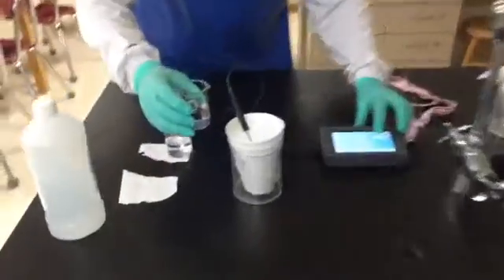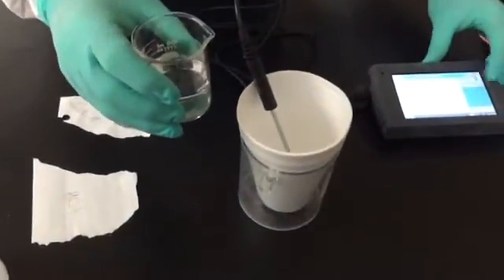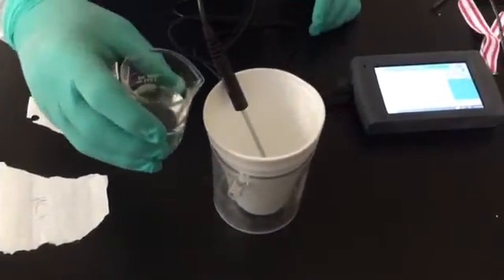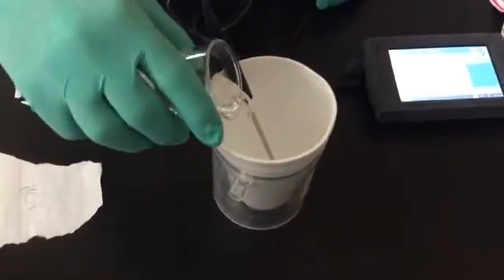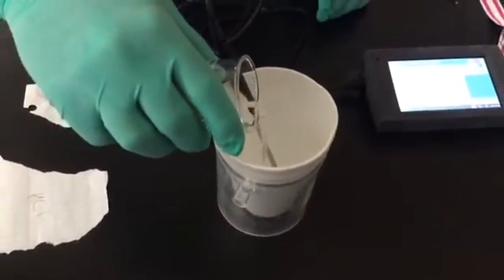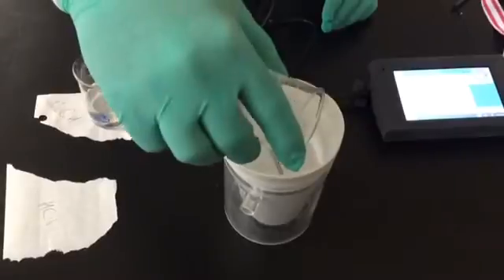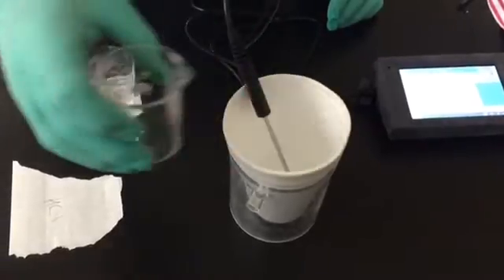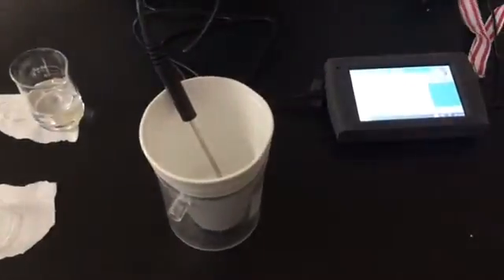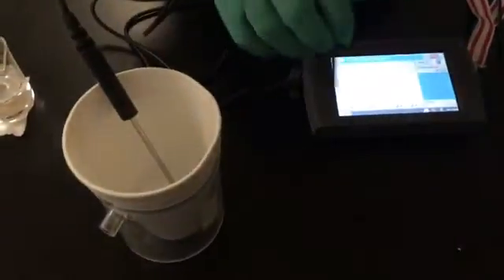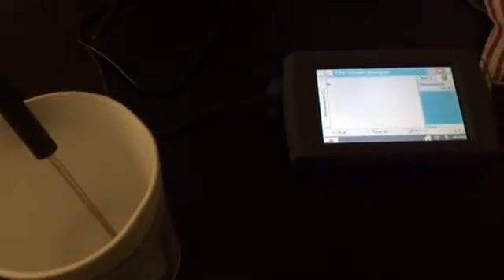Now this will be an example of an acid-base reaction. I'm putting hydrochloric acid into our styrofoam cup calorimeter. We will wait until the temperature levels off and then start data collection.